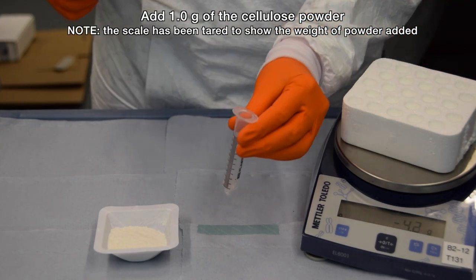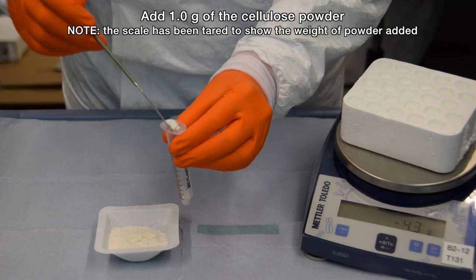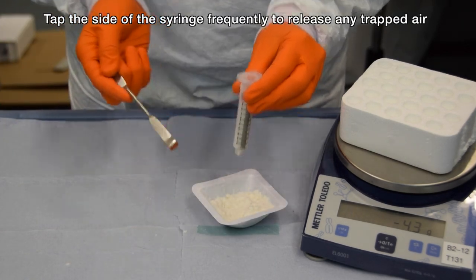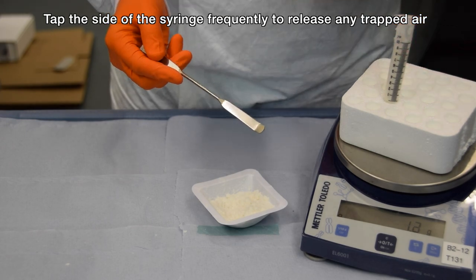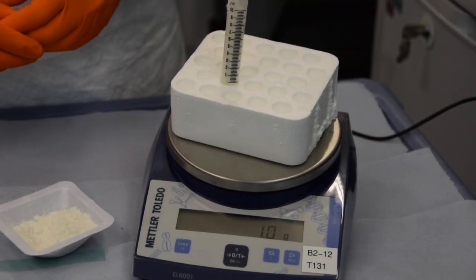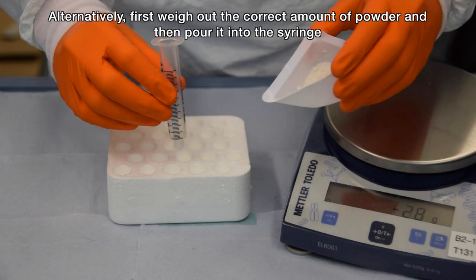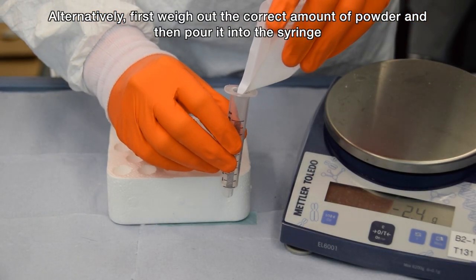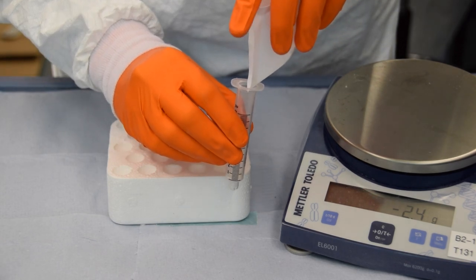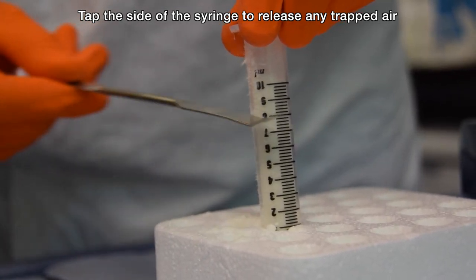Add one gram of cellulose powder, tapping the sides of the syringe frequently to release any trapped air. Alternatively, you could first weigh out the powder using a weighing board or a piece of clean paper and then pour it into the syringe. Tap the sides of the syringe a few times to release any trapped air.